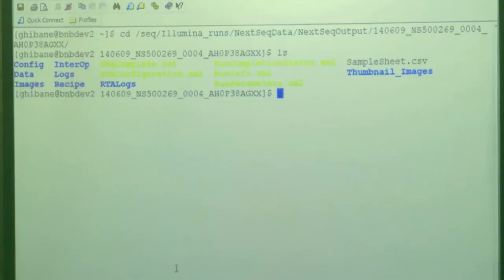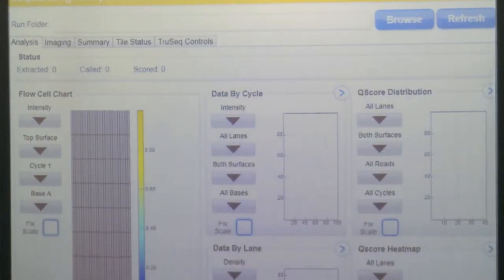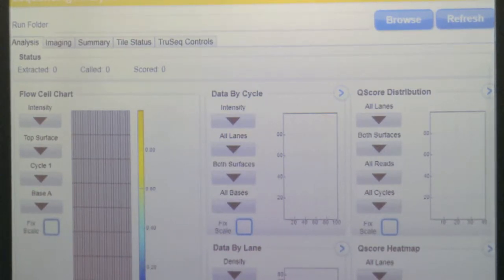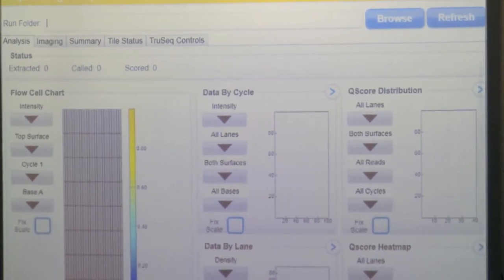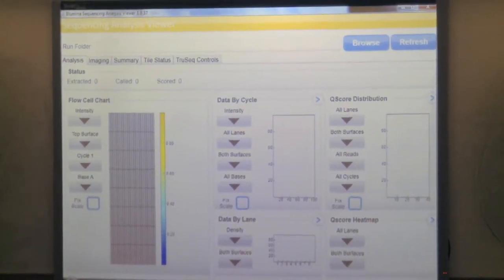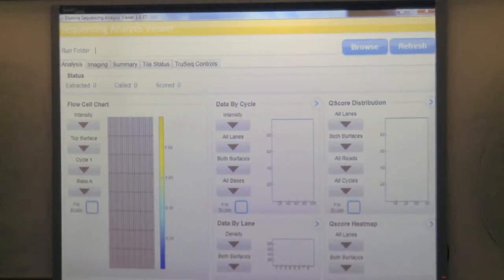Illumina has two other softwares. One is the Sequencing Analysis Viewer - a completely independent piece of software that can be run on a completely different computer than the sequencer. Unfortunately it doesn't work on Mac, it's only on PC. Actually all their softwares are only for PC, not Mac. The software can be downloaded from Illumina.com. I go to this software, load the run by clicking Browse and navigating to that specific location.